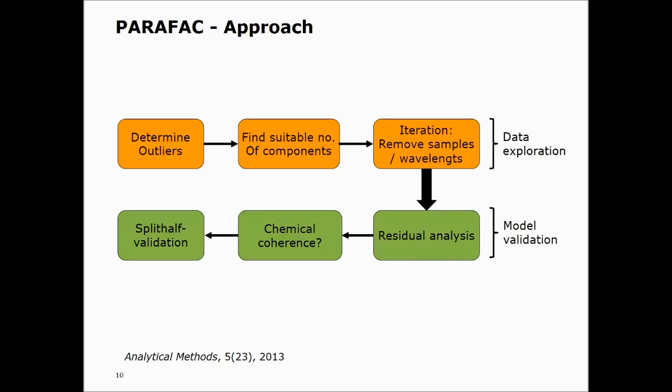So let's take a quick look at the ParaFAC approach to modeling. The practical sequence of things that you have to take into account before coming up with a valid ParaFAC model that you can then use to interpret your data. This approach is basically split into 2 parts. One is the data exploration phase, and the second one is the model validation phase.